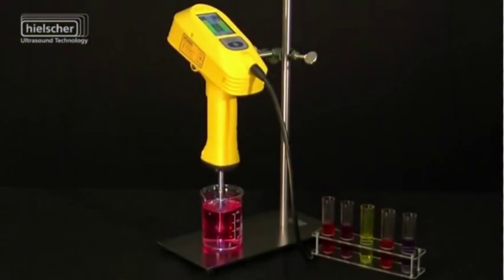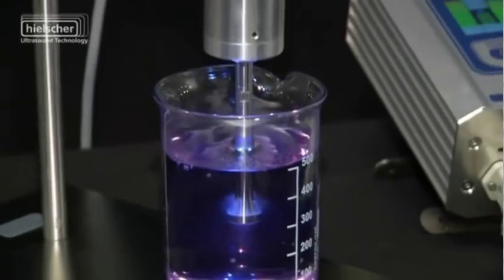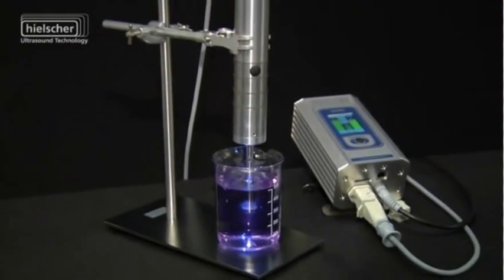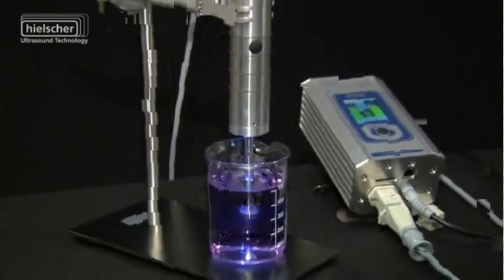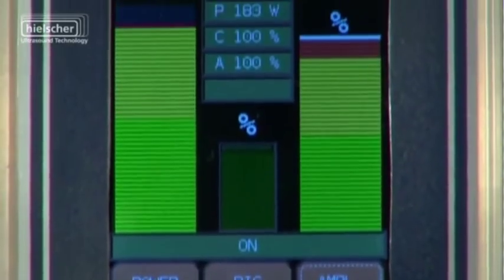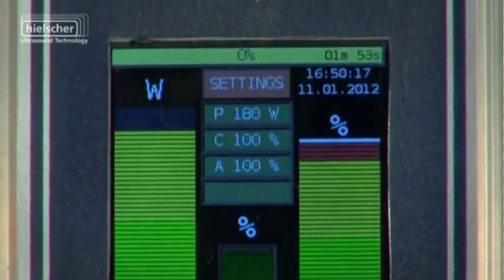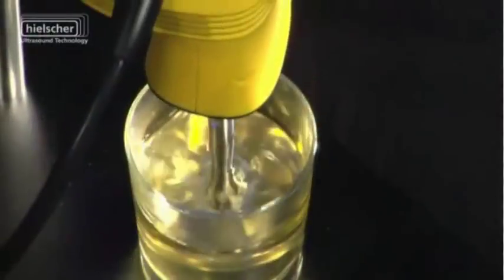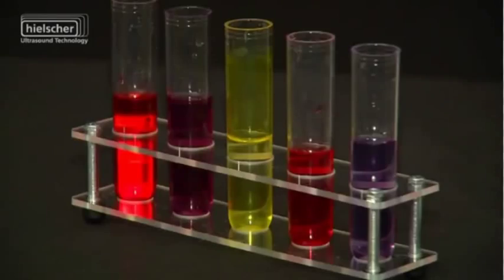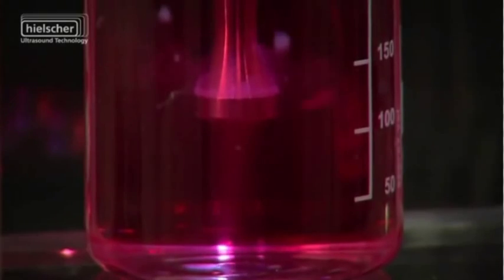Hielscher Ultrasonics GMB-H, leader in the field of ultrasonics, presents the further development of its ultrasonic laboratory equipment series: the compact ultrasonic homogenizer UP200HT and the ultrasonic device UP200ST, conceived and built with separate transducer and generator.